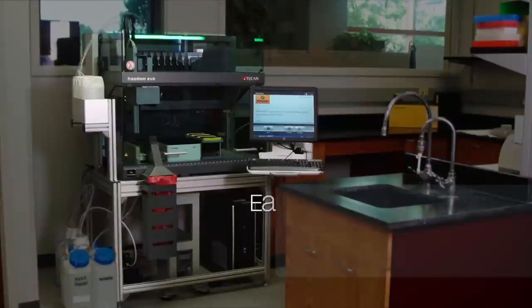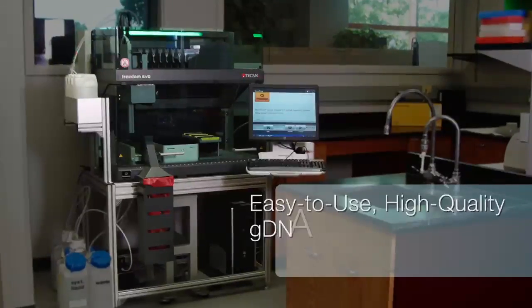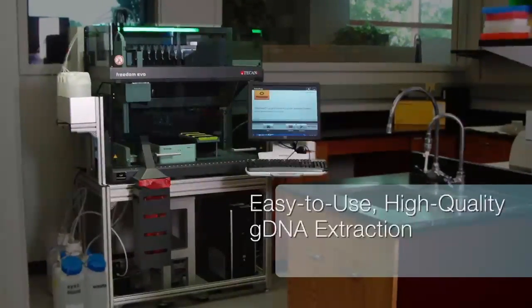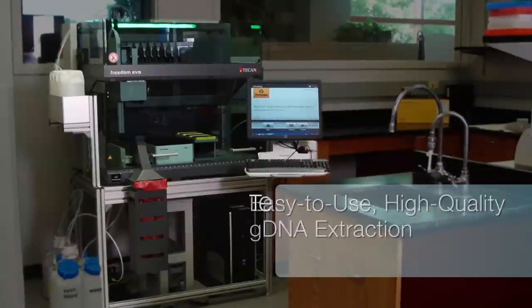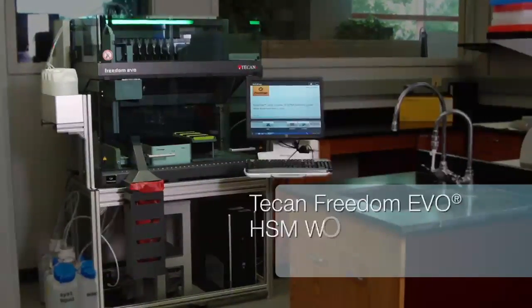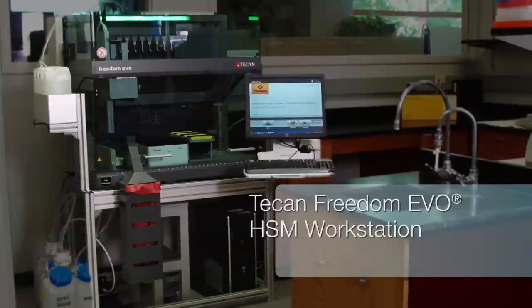Automated purification of genomic DNA on the TCAN Freedom EVO HSM workstation provides an easy-to-use purification system as part of high-throughput genomics processes.